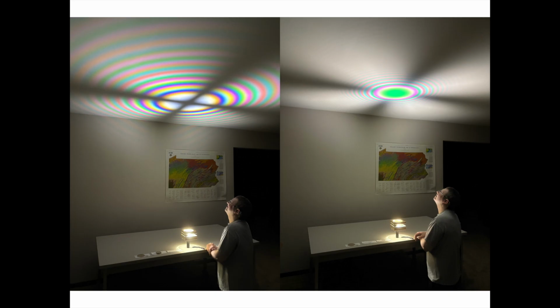With our corundum, you can see our isogyres, the dark bands, meet in the center of the image with a cross. However, with our quartz interference figure, we have a distinct circle of color that the isogyres don't actually end up entering. This bullseye circle at the center of our interference figure is caused by the optical activity of quartz.